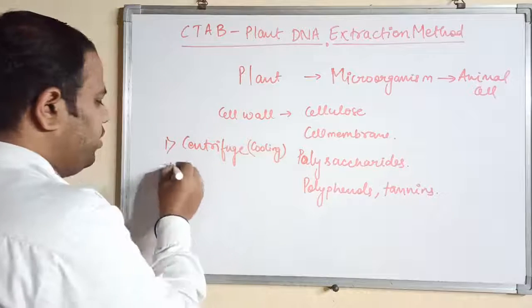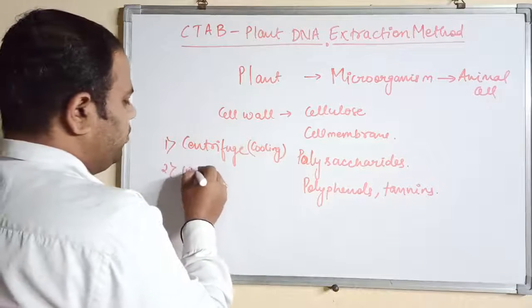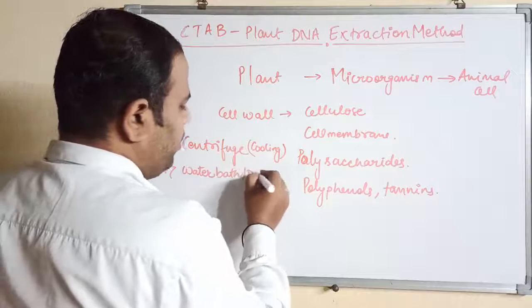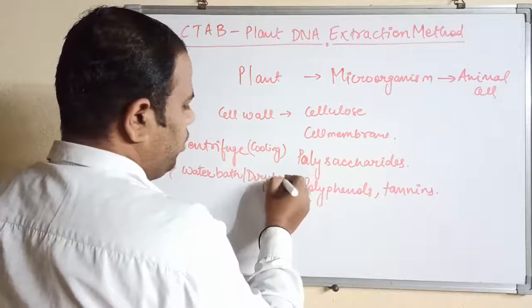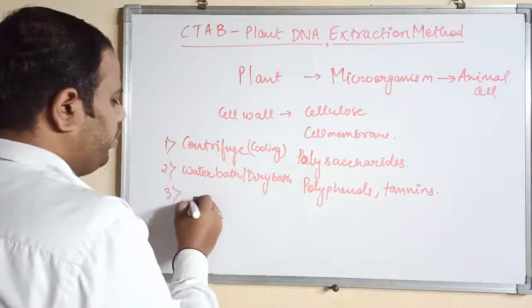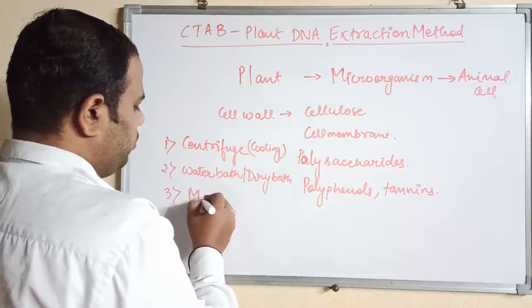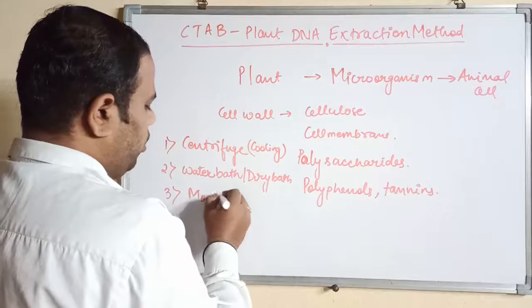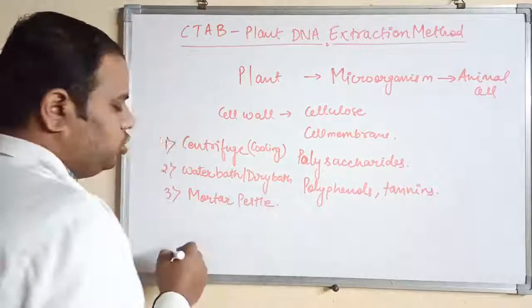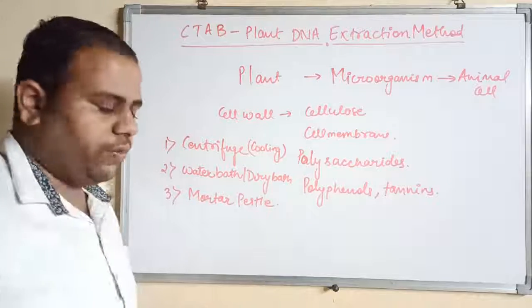Then we require a water bath or dry bath. Then we require a mortar and pestle for crushing of the plant sample.